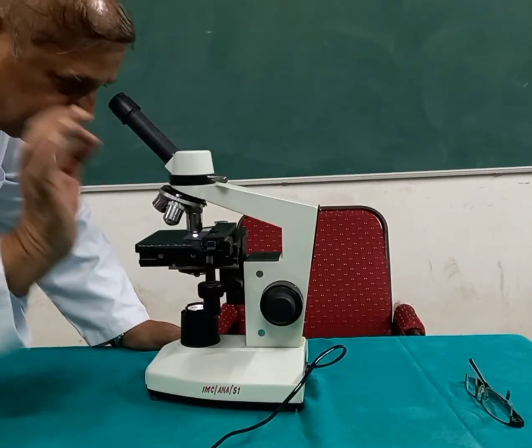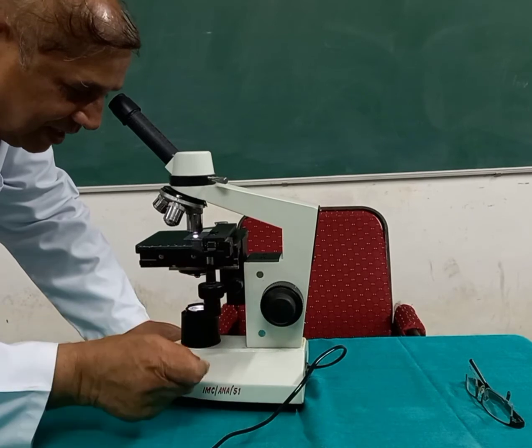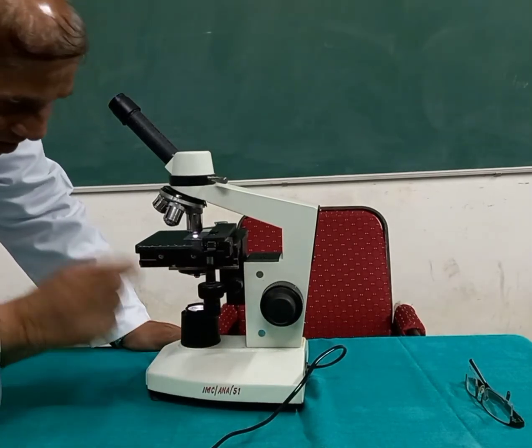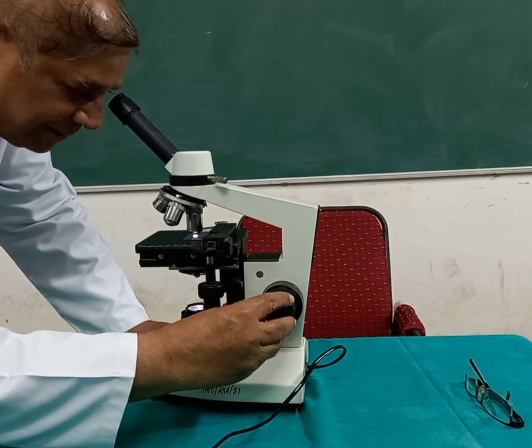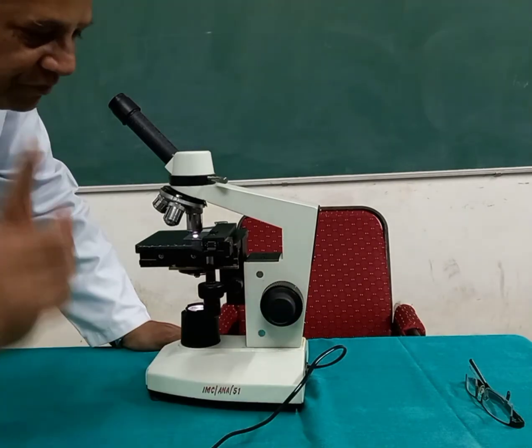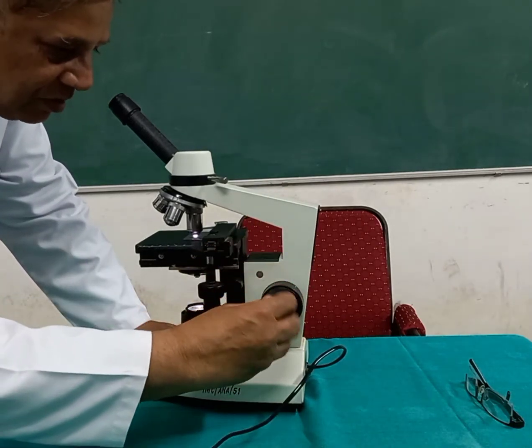I have got a beautiful image here, and I can see a lot of details. Again, the condenser and the diaphragm can be adjusted if you are getting bright light. Reduce the light so that more contrast will be seen here. So the very important step is that don't touch the coarse adjustment, only move the fine.